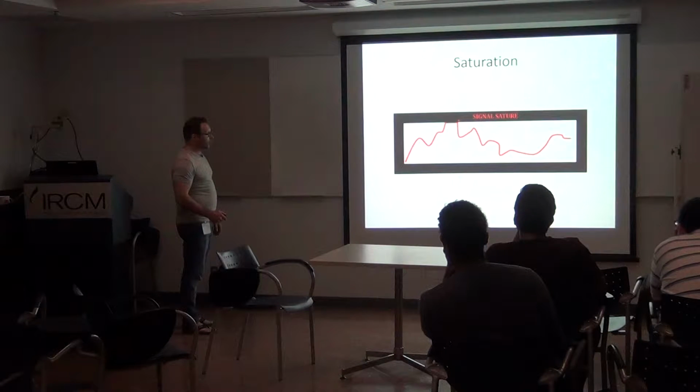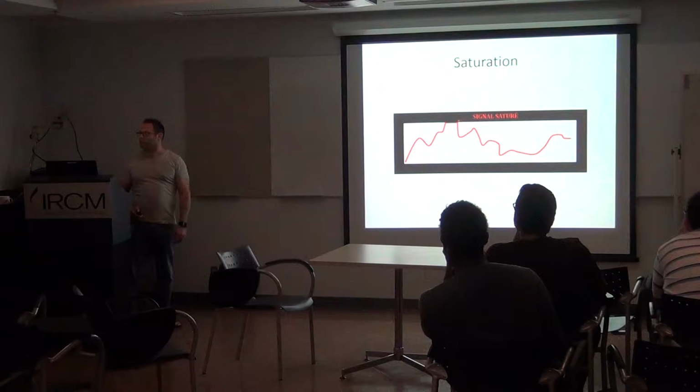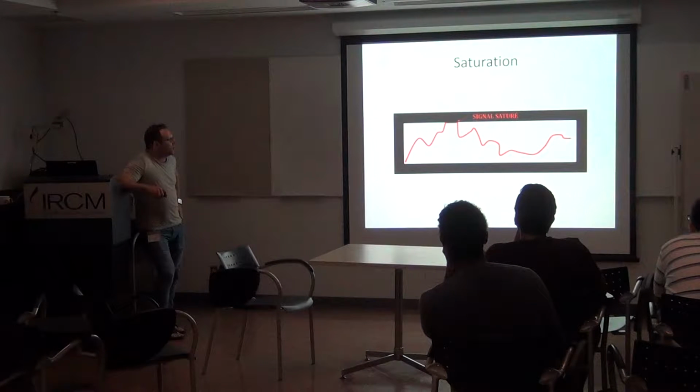So you will get saturation. Okay, so that is basically that. It's like when your eye looks at the sun, the photoreceptors saturate. So then you look everywhere and you see saturation. Okay, so it's the same thing with any device.